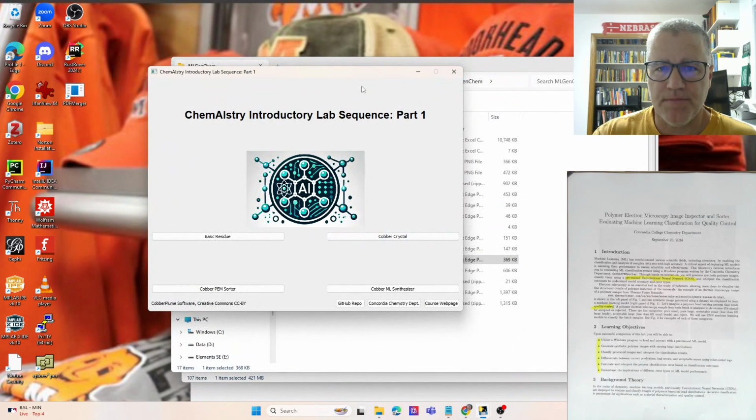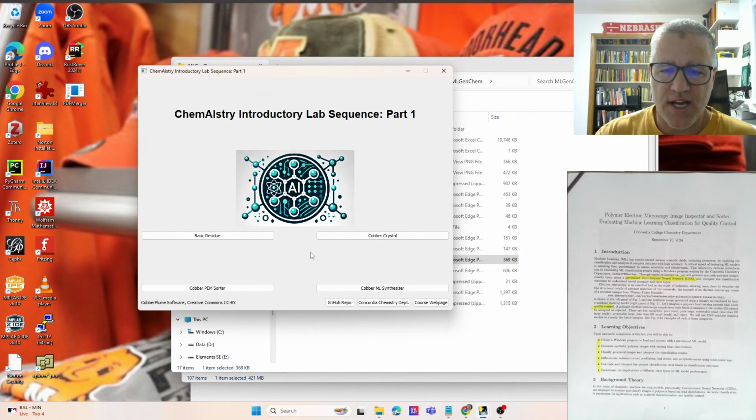So we've got this set up. Let's go ahead and launch now the Polymer electron micrograph sorter.